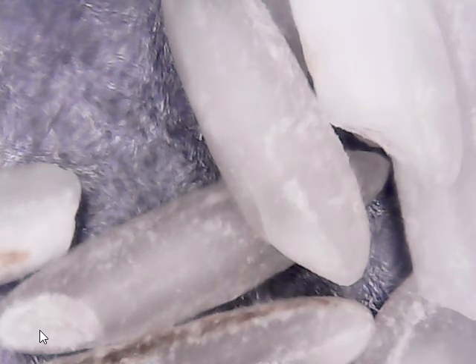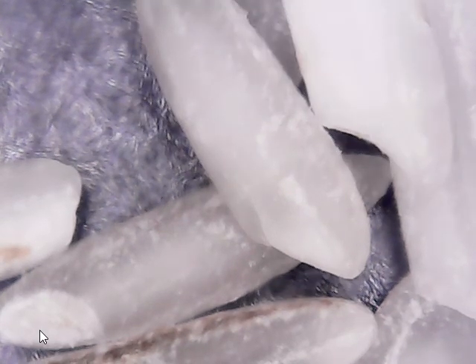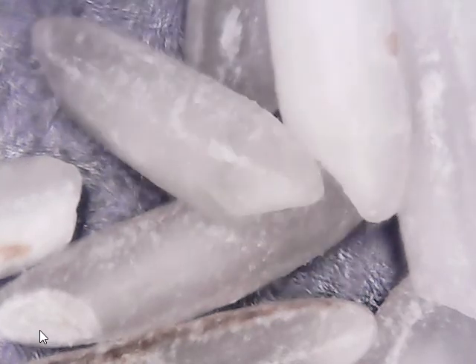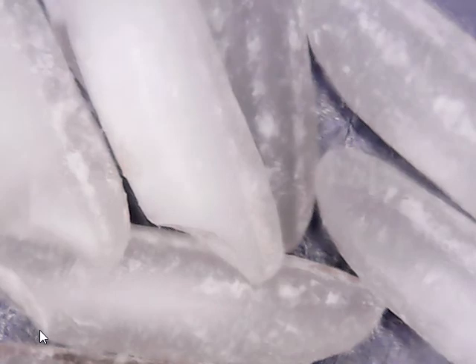Let me just... shoot, poured water on myself. Anyway, that's some tweezers. But that is interesting. This rice isn't cooked by the way, I just want to make sure to clarify. That looks almost like the salt kernels.